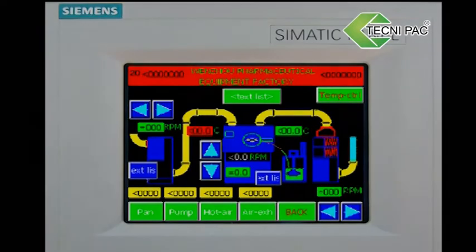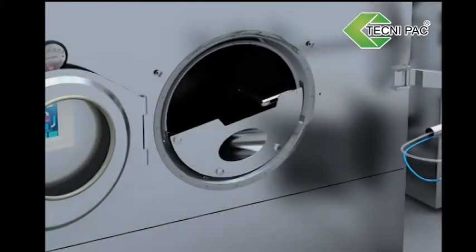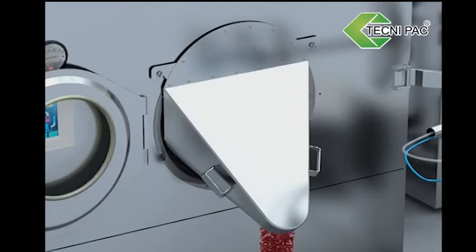Tablet Out. Install discharging device after stopping the machine. Speed is 2 to 3 turns per minute.